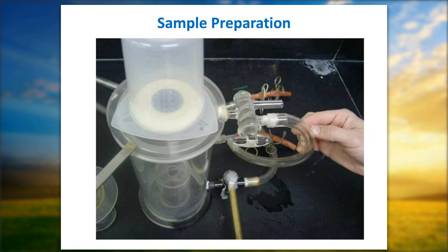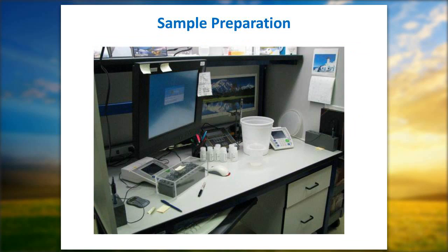Go ahead, Brian, please. And so one of the first steps we do with filtration is to actually look in the 1 liter bottle that you submit as received, and that's right before we conduct the pH and conductivity analysis. That is the first chemical analysis done here in the laboratory, and that's the station you're looking at right now. We have our apparatus and instruments for doing pH and conductivity. And next slide. And then once we filter the sample and do pH conductivity, we prepare it for analysis in the laboratory. This happens to be our flow injection system where we do ammonium and orthophosphate.